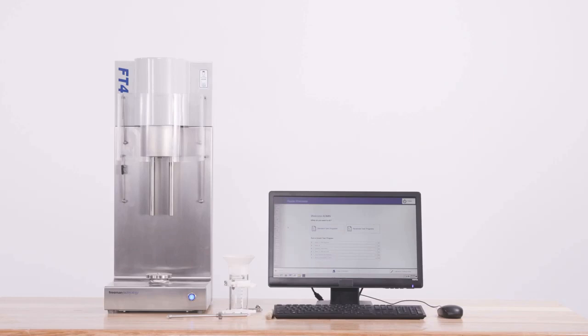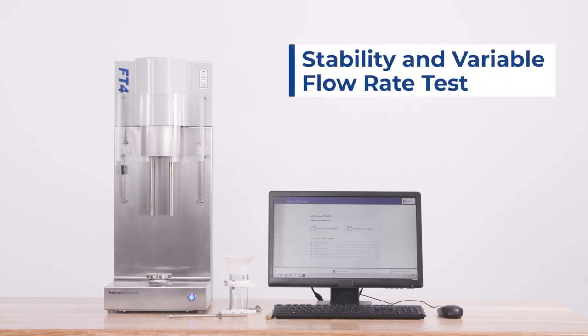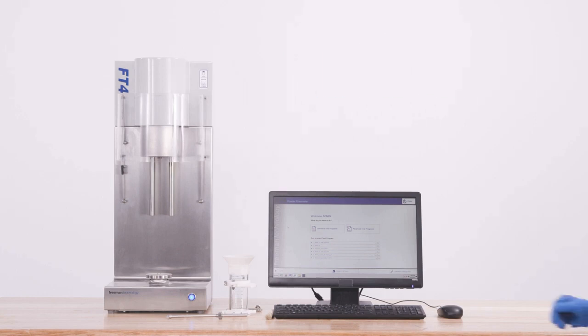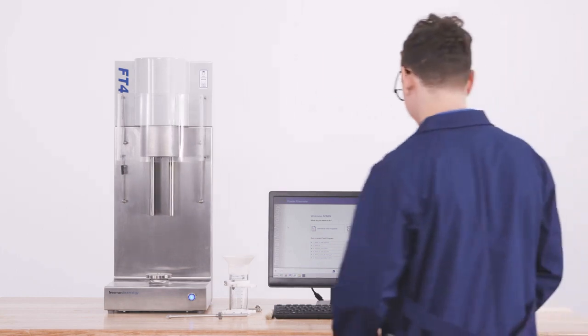First, we'll take a look at the instrument and start with the first test we're going to be using to characterize powder flow. This first test is going to be stability and variable flow rate. I'll go into the details of this test, what it measures, and how to perform it.